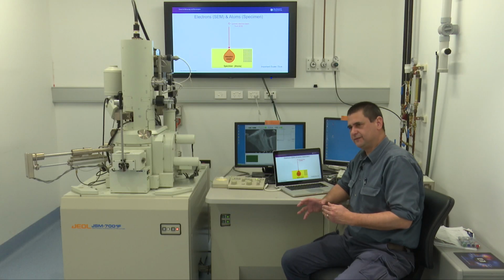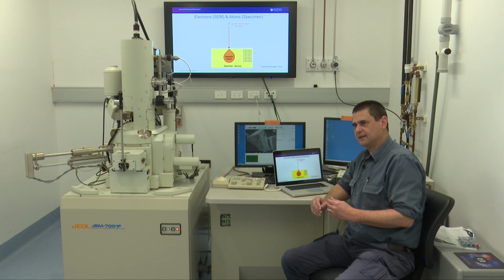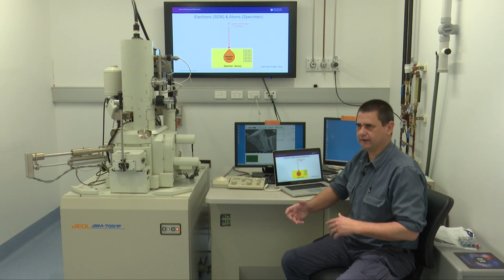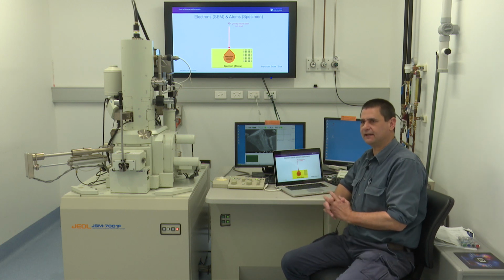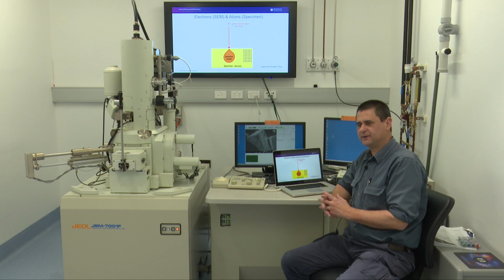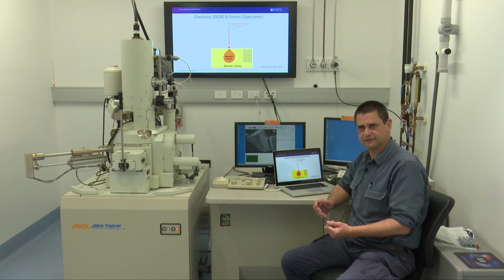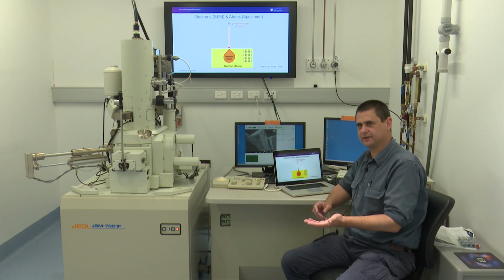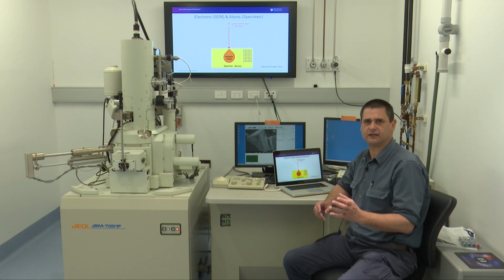People sometimes get confused in X-ray microanalysis, and I think they get too involved at the interface of the software and the settings and stuff like that. Certainly you need to know that, but I always like to start at the fundamentals and then build my way up from the basics to how the system should be operated. So let's never lose track of the fundamentals.